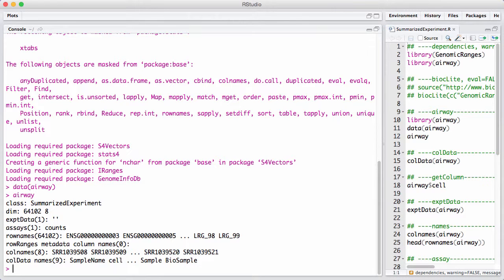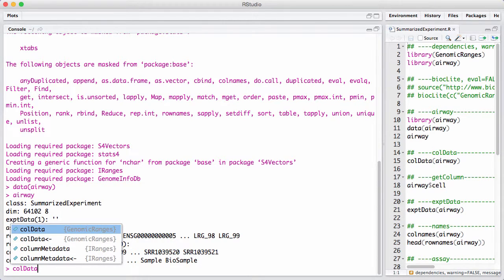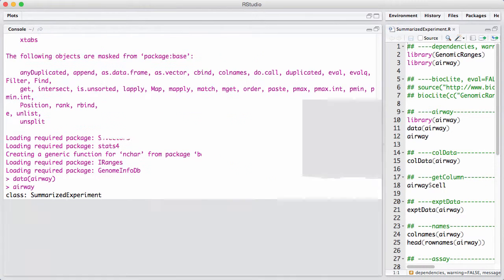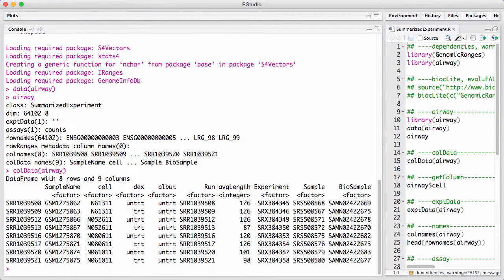There are a lot of things that are very similar to ExpressionSet, but with a slightly different syntax and output. What we are used to knowing as pData from ExpressionSet, we access using colData in the SummarizedExperiment. It returns not a data frame, but a capital DataFrame — the new type of data frame introduced in Bioconductor.